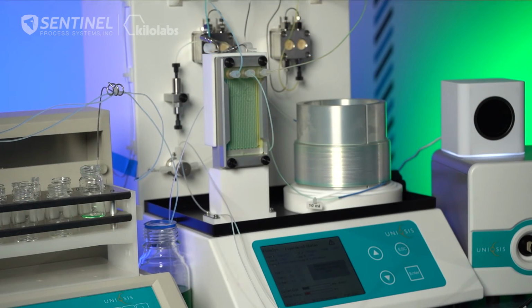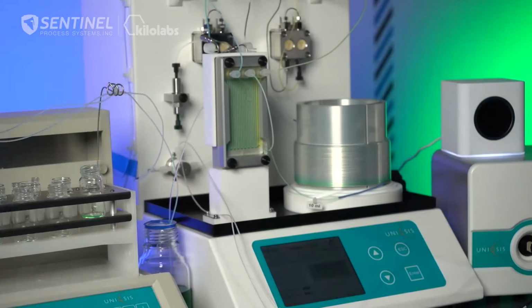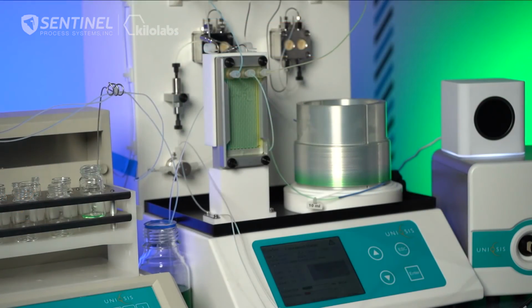So you can see the coil is, actually the next experiment has started, so there's now green entering the bottom, but the top of the coil is almost all solvent. It's clear, up to 100% transmittance at the top, and you'll see your next experiment start when the rest of that green gets up and comes out through the flow cell.